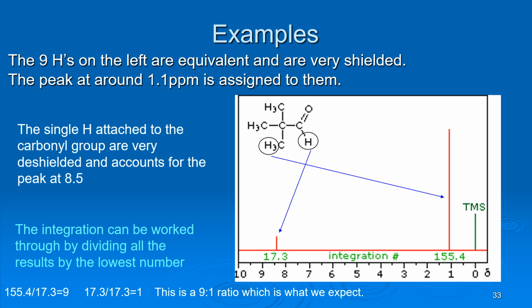All right, here's one more example, and this one I do want to point out. I've already given you the arrows here. So here's a hydrogen directly attached to a C double bond O. So this time it's not on a carbon attached to a C double bond O, but the hydrogen itself is attached to a carbon. So it's highly de-shielding. And so you can see here that actually gives rise to a peak close to 9, somewhere between 8 and 9.